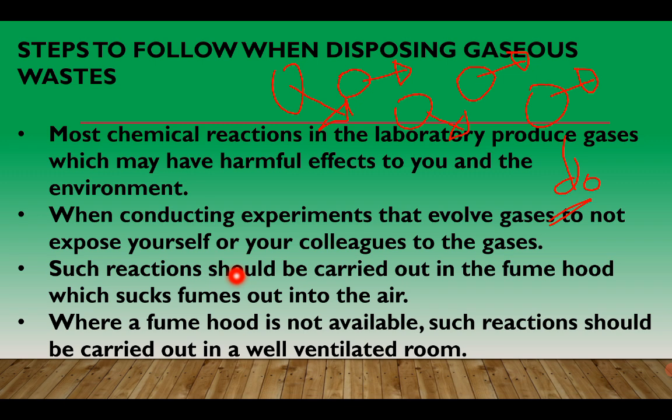So the gases are removed from the lab through diffusion to the outside of the laboratory. Okay, in so doing, you and your friends are safe.